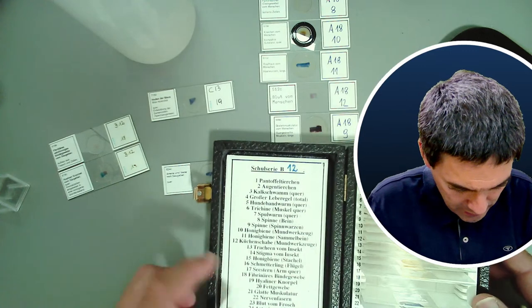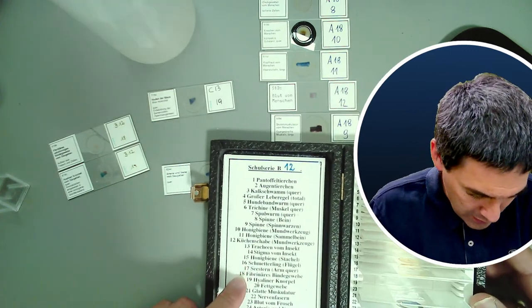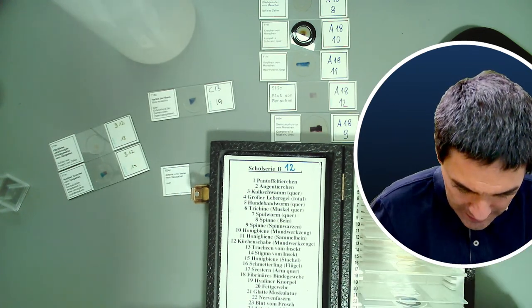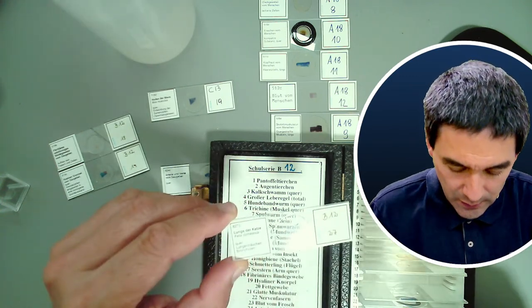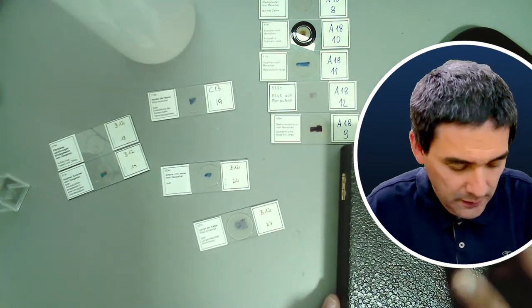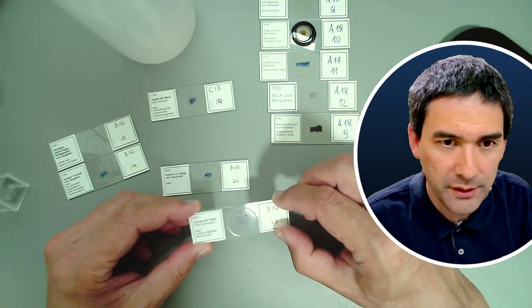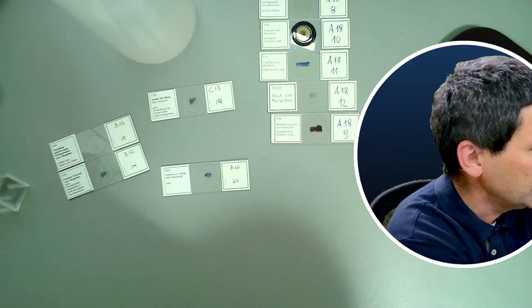Lung is... Also, I made a video some time ago about the lung. Lung, number 27, of a cat. Here it is. Yeah? Cat lung. And let's have a look here, because we're actually able to see the alveoli. Yeah? So again, that's why in a human being it looks the same, so it doesn't really matter.